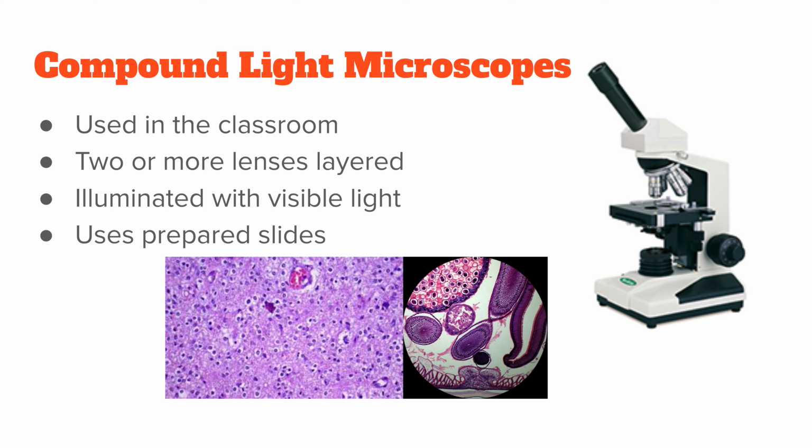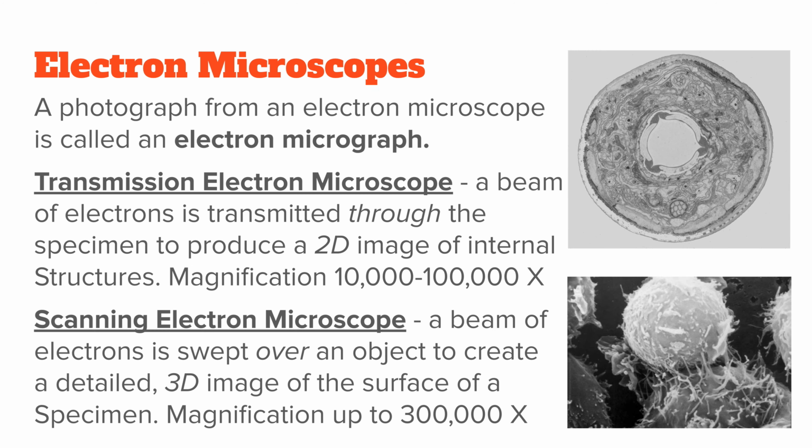They are fairly simple compared to the other ones, but they have very good resolving power, at least when we want to look at the scale of cells themselves. But there are other types of microscopes too. We can also have electron microscopes.